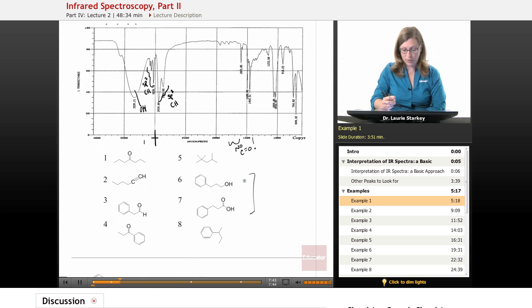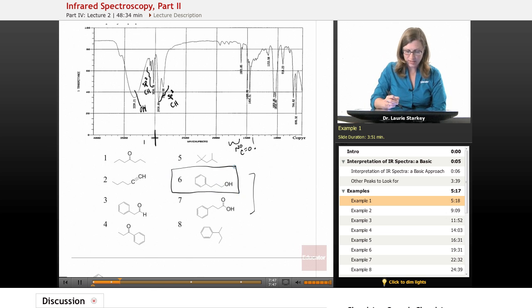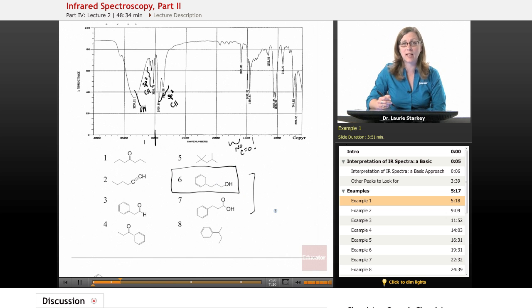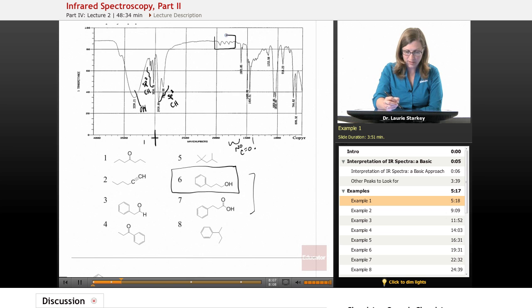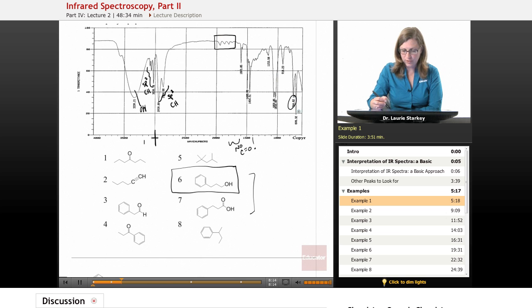Now that we think it's compound six, let's go back and find some of the needles in the haystack that will more completely label this spectrum and give us further evidence. Because it has an aromatic ring — a mono-substituted ring — I see this aromatic ripple here, which is consistent with the mono-substituted pattern. We should also find two peaks around 700–750, and there they are. So this is mono-substituted aromatic, which we call the out-of-plane bending. This gives us more evidence for that structure.